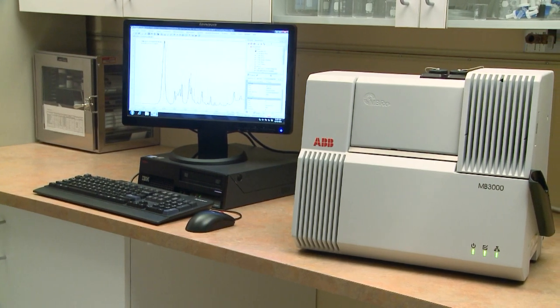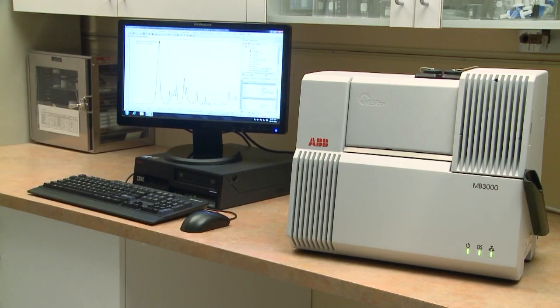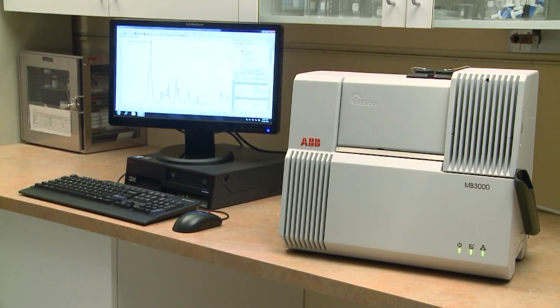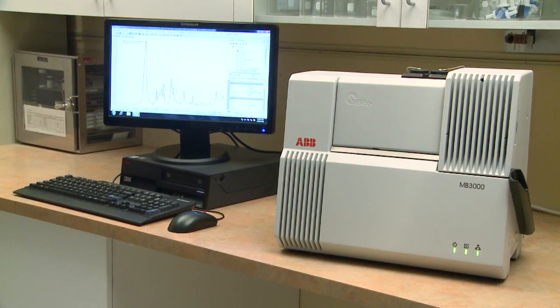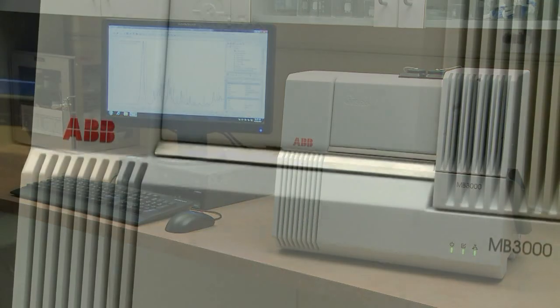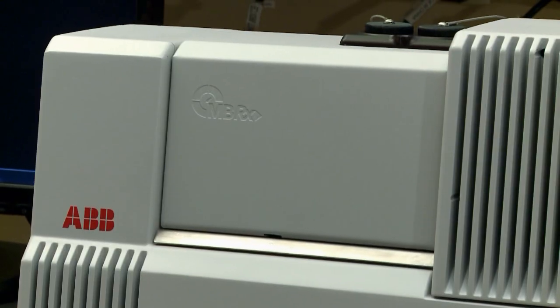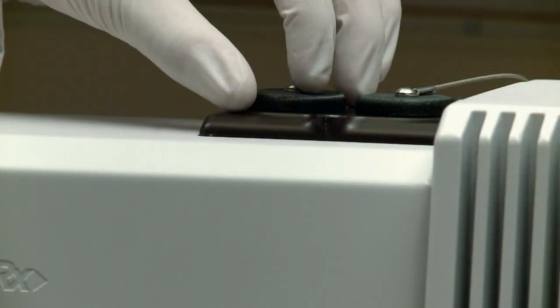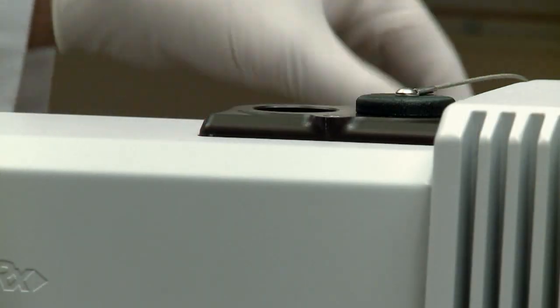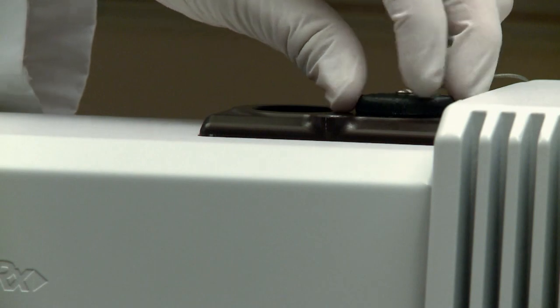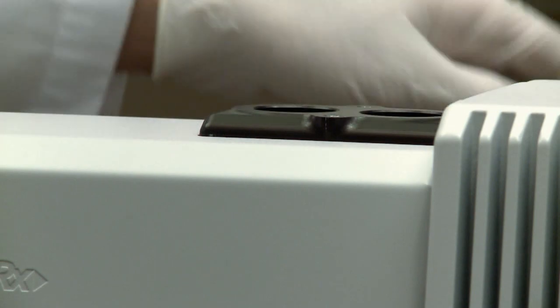The MBRX is a plug-and-play solution designed around the key concepts of analytical performance, reliability and simplicity. It does not require any maintenance or consumables, such as liquid nitrogen.